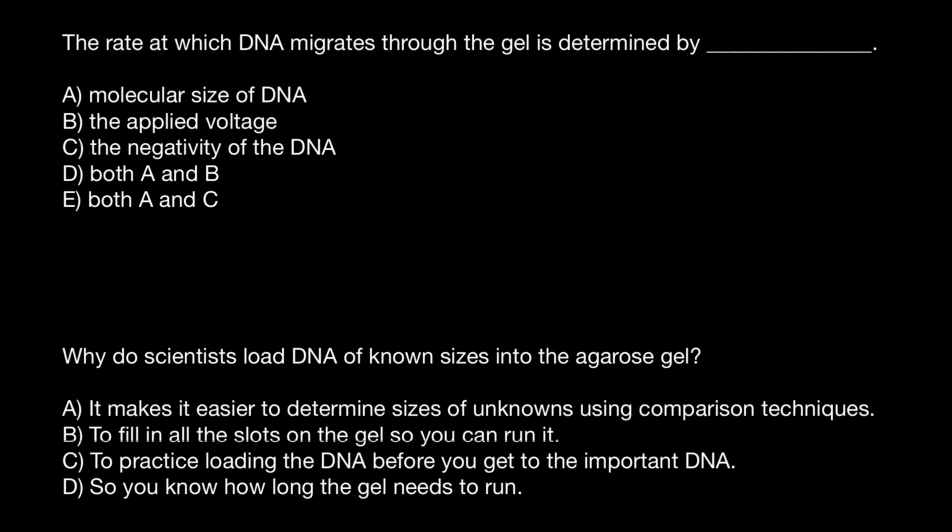And here's the first question: the rate at which DNA migrates through the gel is determined by... and we have to choose one of the answers. But first, a little bit of theory.